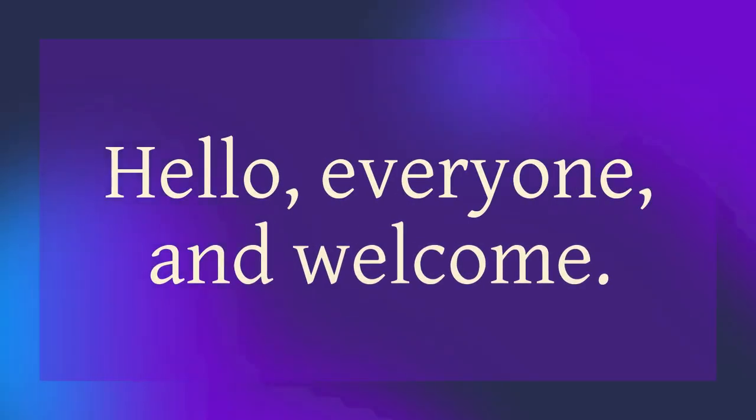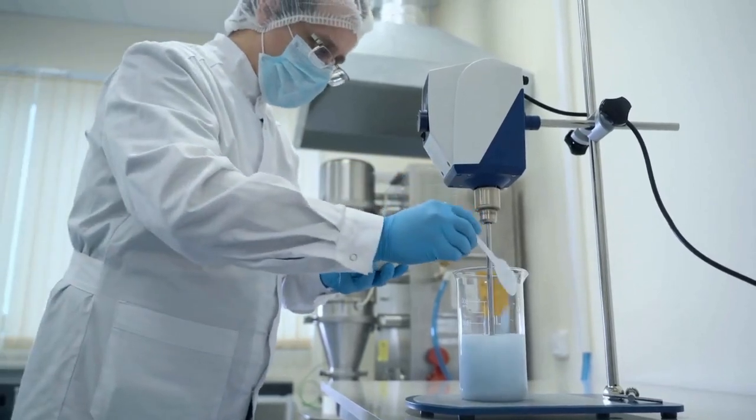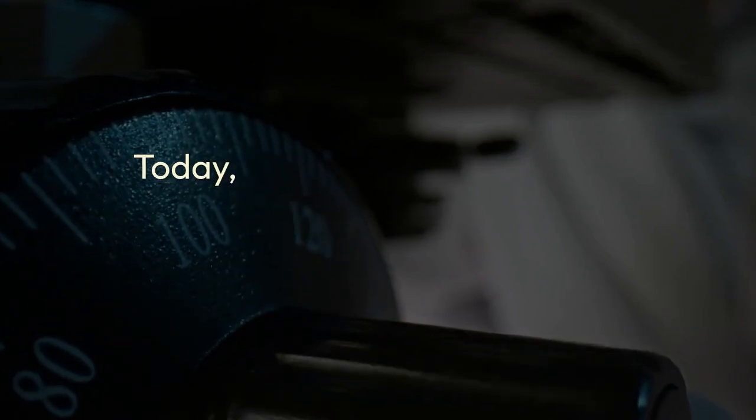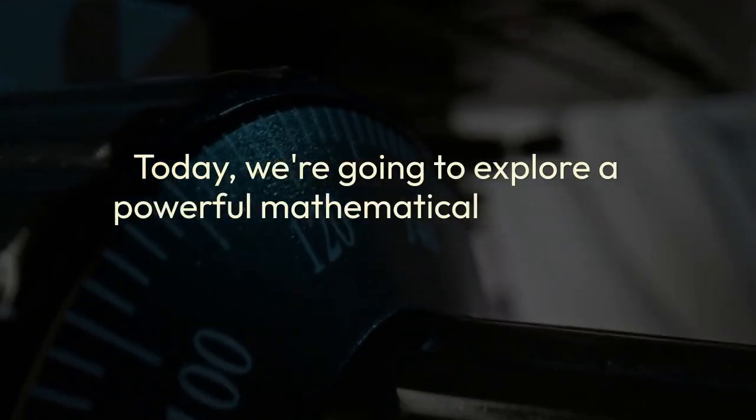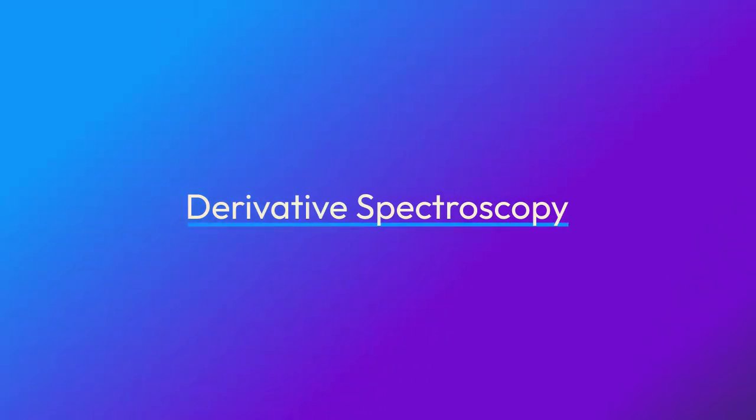Hello everyone, and welcome. Have you ever looked at a scientific graph, specifically a spectrum, and seen broad, overlapping humps instead of sharp, clear peaks? It's a common problem in chemistry and physics, making it difficult to identify what you're looking at. Today, we're going to explore a powerful mathematical technique designed to solve this exact issue: derivative spectroscopy.